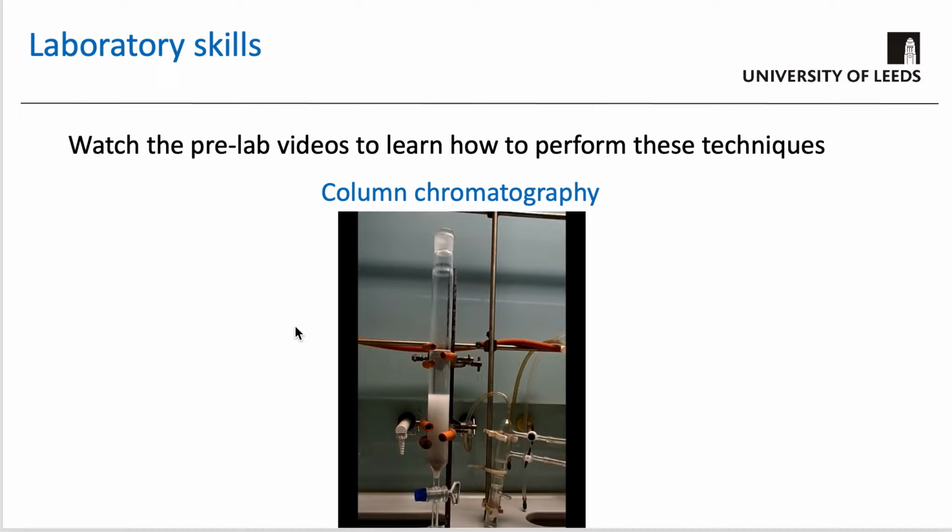So we have a video showing you how to set up a column and run a column to separate mixtures of compounds. Do watch this video carefully, as there are lots of different steps that you need to perform, and it's also a particularly different technique to what you've used before, so there will be a lot for you to process here. So do watch this video very carefully.